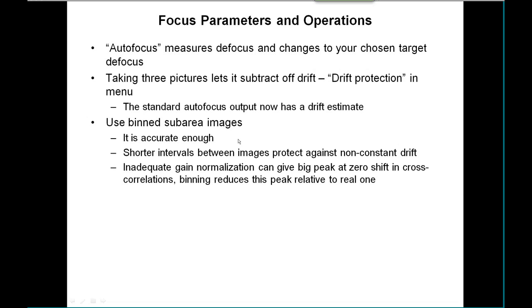The third point is more subtle but a common source of problems. If you don't have a good gain normalization, you have fixed pattern noise in all your images where all images have single pixels that are the same or vary by the same amount. When you cross-correlate those two images, this produces a big peak at exactly zero shift. Binning will reduce this peak relative to the real peak, which is a nicely rounded one not reduced by binning. There is some protection built into the program, but binning is another important component of that protection.